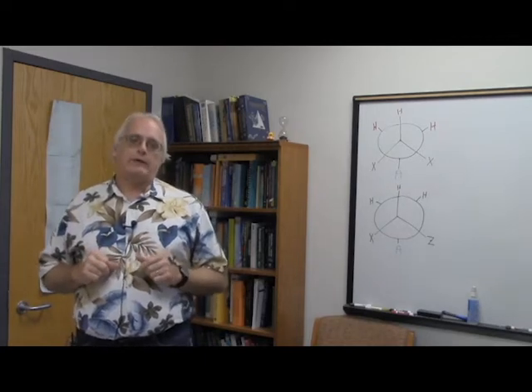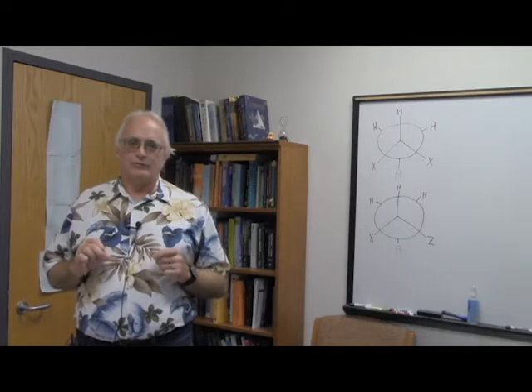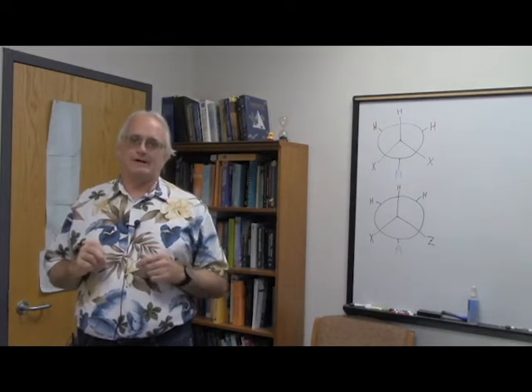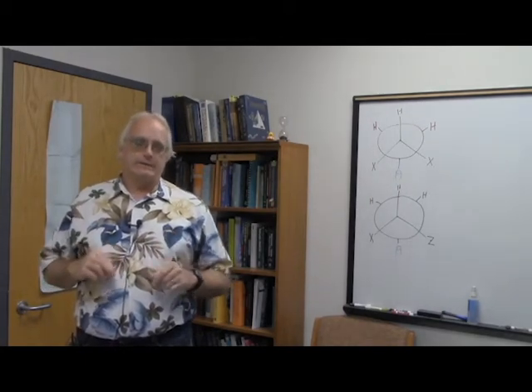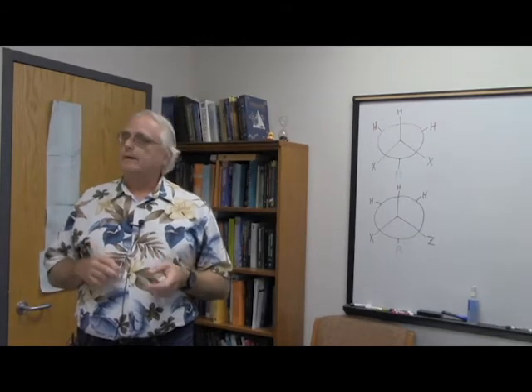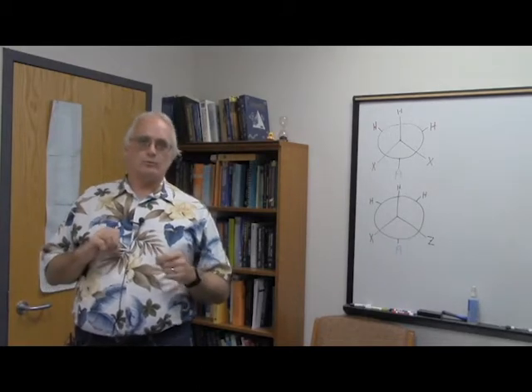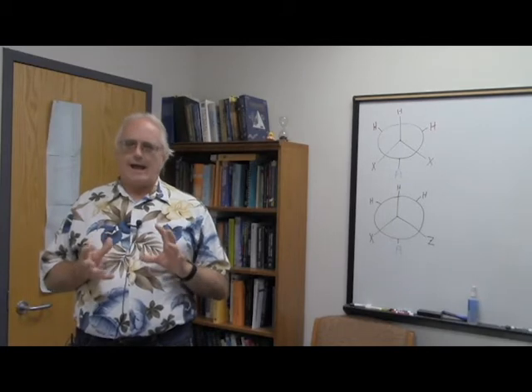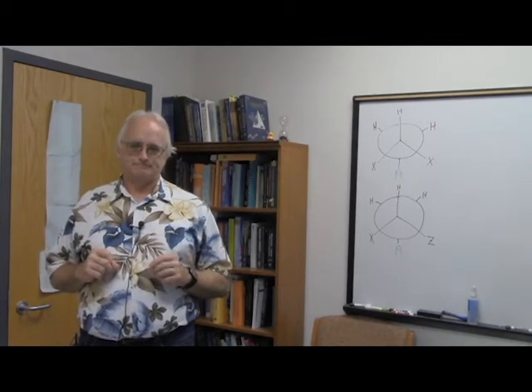I want to push ahead with that because there are some really interesting examples of methylene groups giving us trouble that don't involve signal overlap or terminal alkenes. The other great source of methylene trouble: chiral molecules. So I want to show you two examples, one non-chiral, one chiral, and show you exactly how that can really affect the appearance of an NMR spectrum.